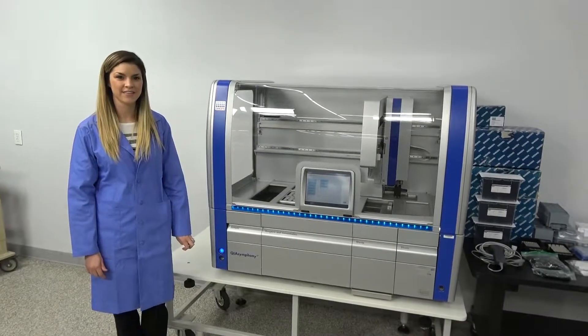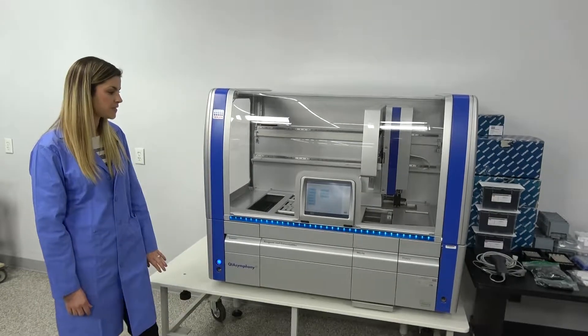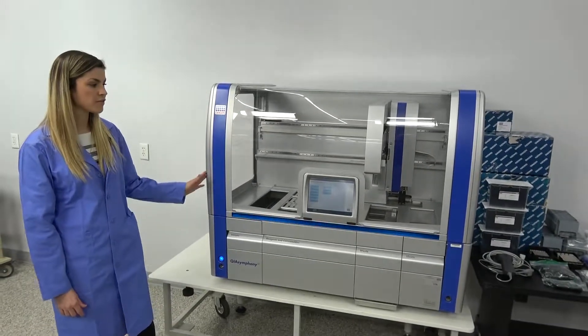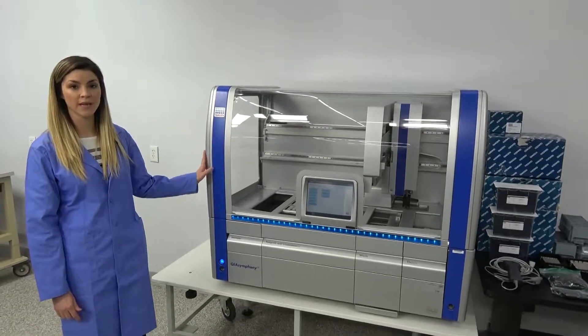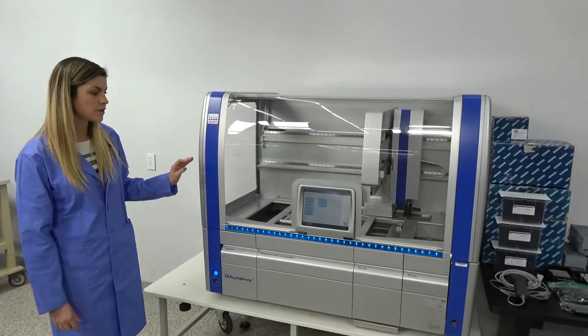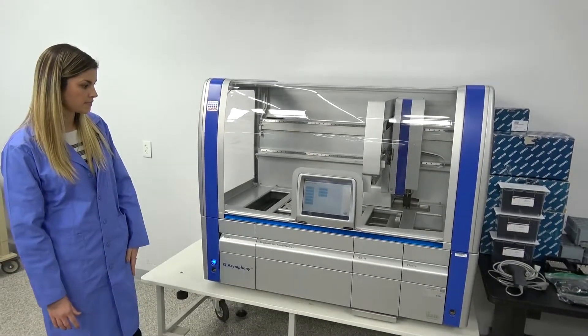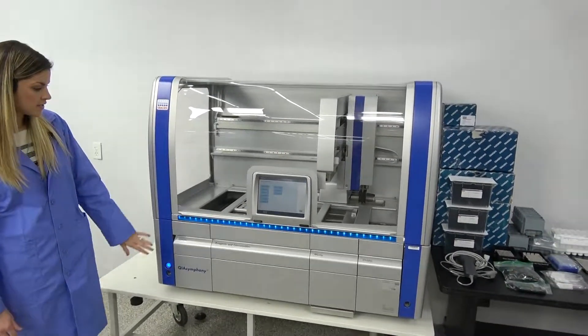Hi, I'm Heather with New Life Scientific and today we're going to talk about the QIAGEN QIAsymphony SP. This unit has been run through our tech shop. It has been very well maintained and it is a very low on hours unit, so it hasn't been used very much. As you can see, it is extremely clean and well taken care of.